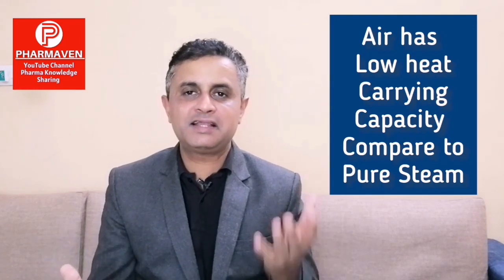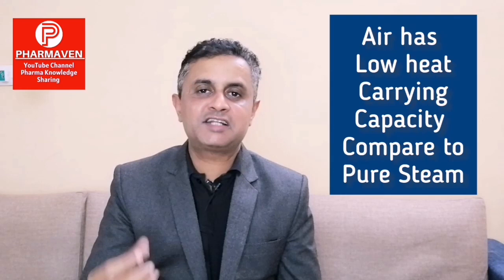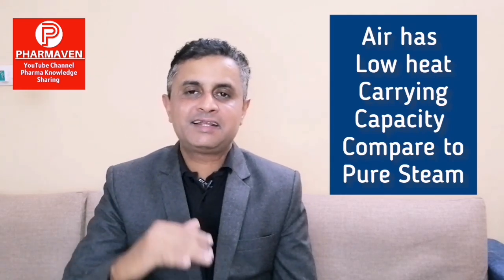If there is air inside the steam, which we call non-condensable gases, then what will occur? This air will act as an air pocket, or it will form a layer of air onto the load. How can the presence of air impact the sterilization? Let's understand. Air has a much lower heat carrying capacity compared to steam. For equal amounts of air and steam, the steam carries a much higher amount of heat than the air. So the presence of air in steam restricts the capacity of steam to heat the load. It creates air pockets and patches of cool areas within the load. If it is a layer, it will not allow heat penetration to the load; it will not allow the latent heat of vaporization to transfer to the load. That way it will prevent the steam's capacity to heat the load to achieve effective sterilization.